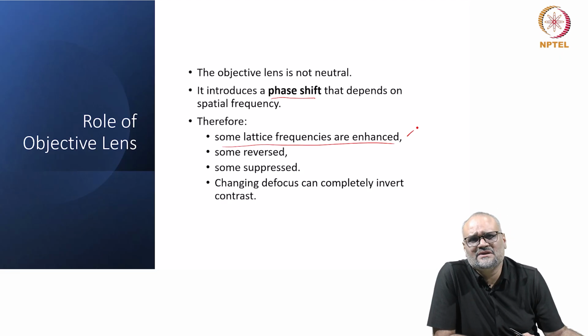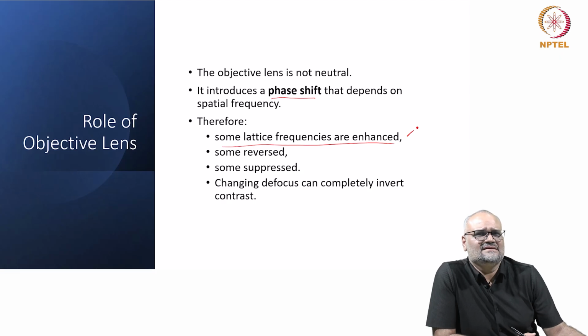So as an example, if I ask you to look at the lattice fringes from a simple cubic or a face-centered cubic sample oriented along the 001 direction.